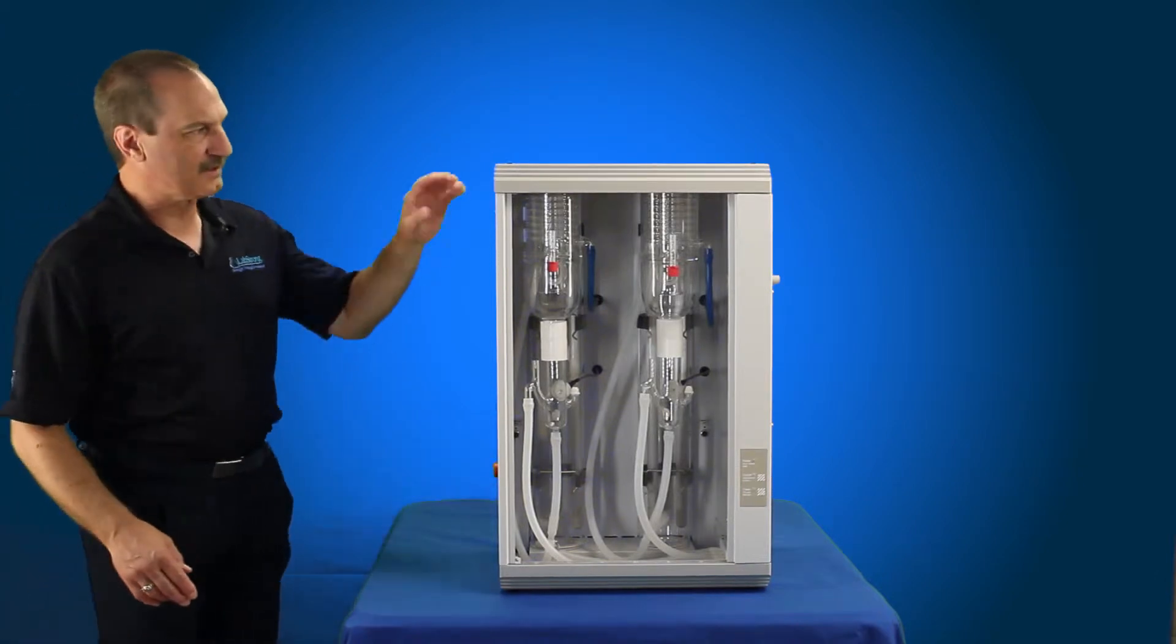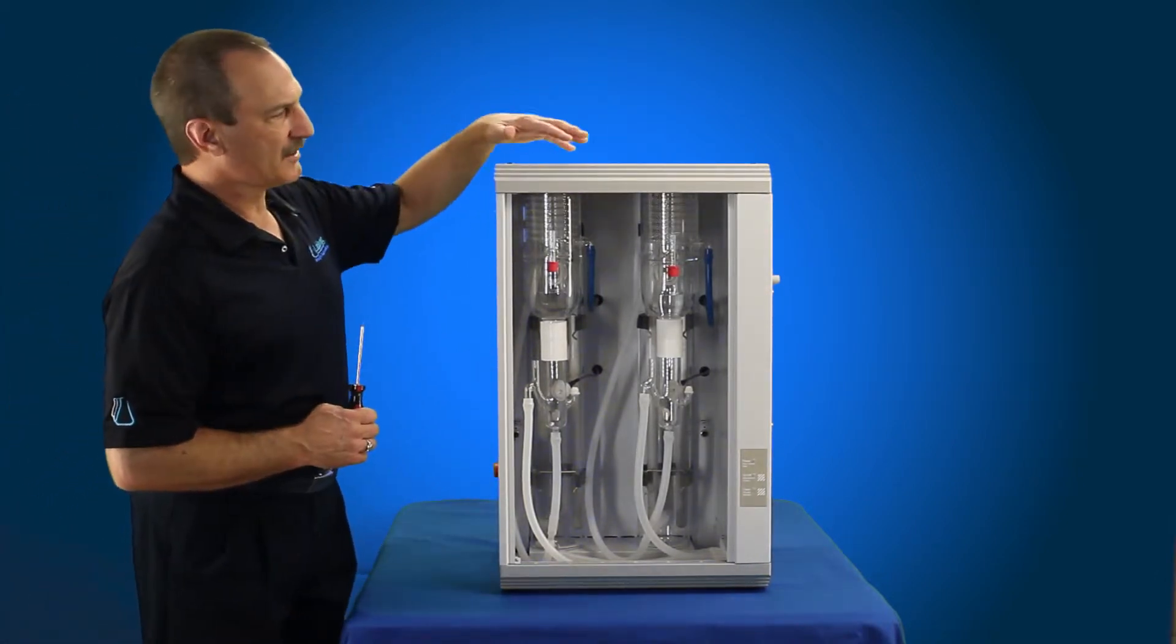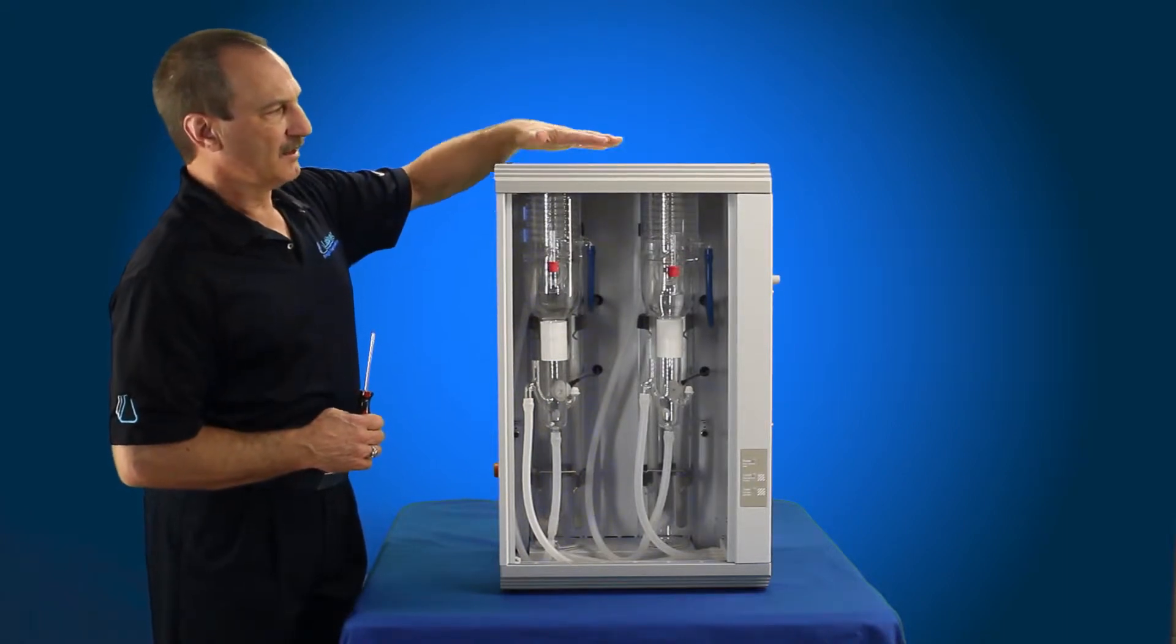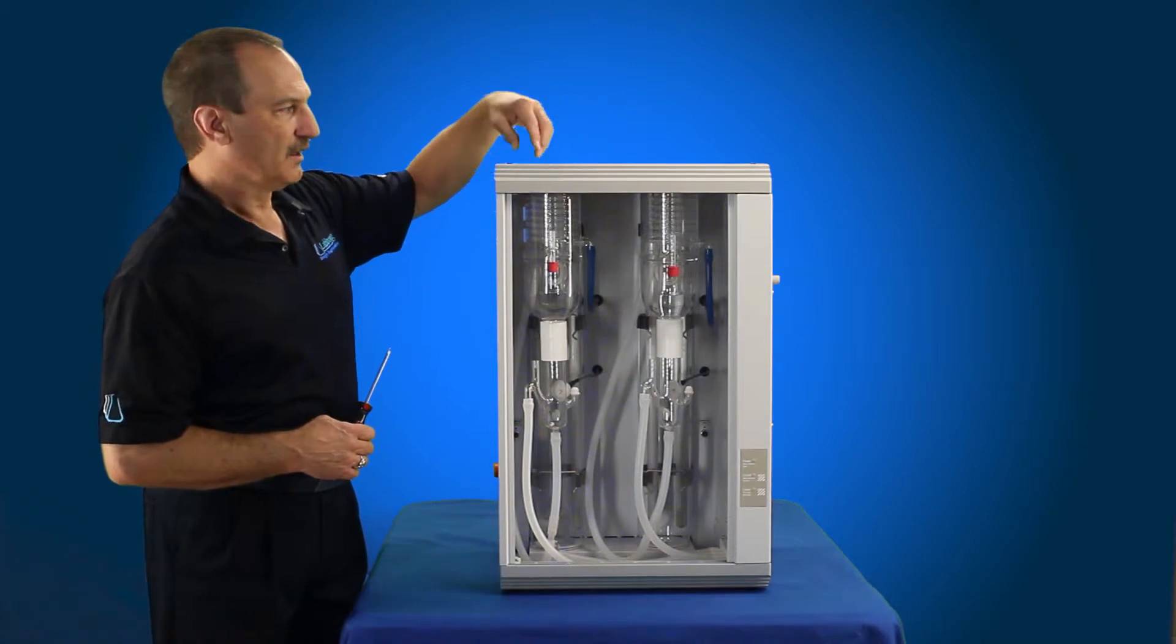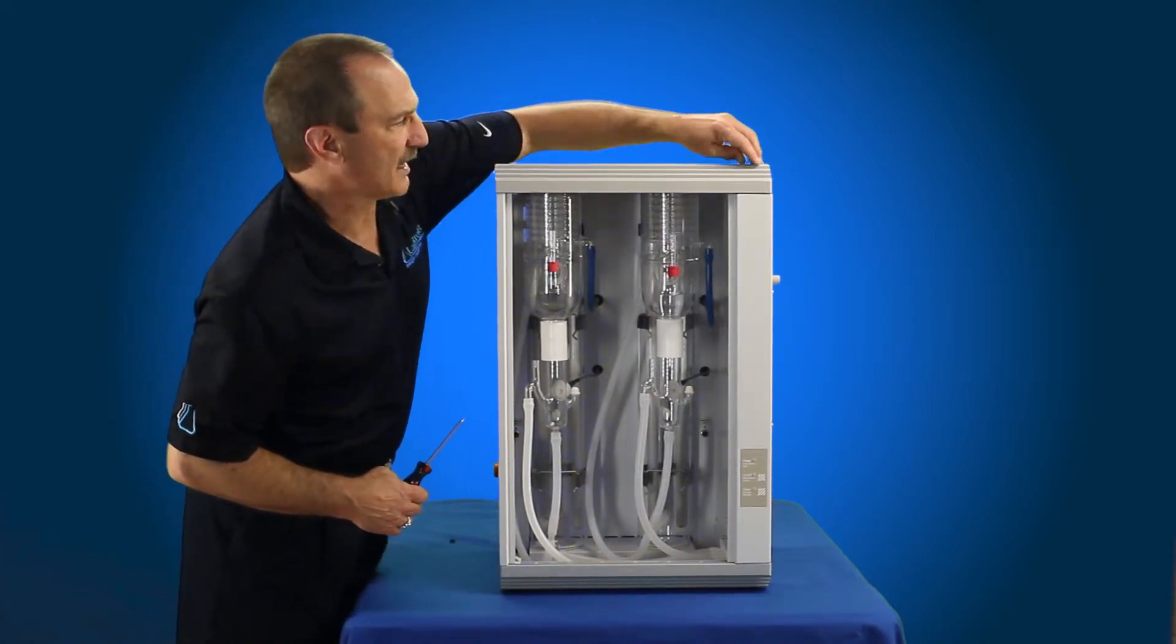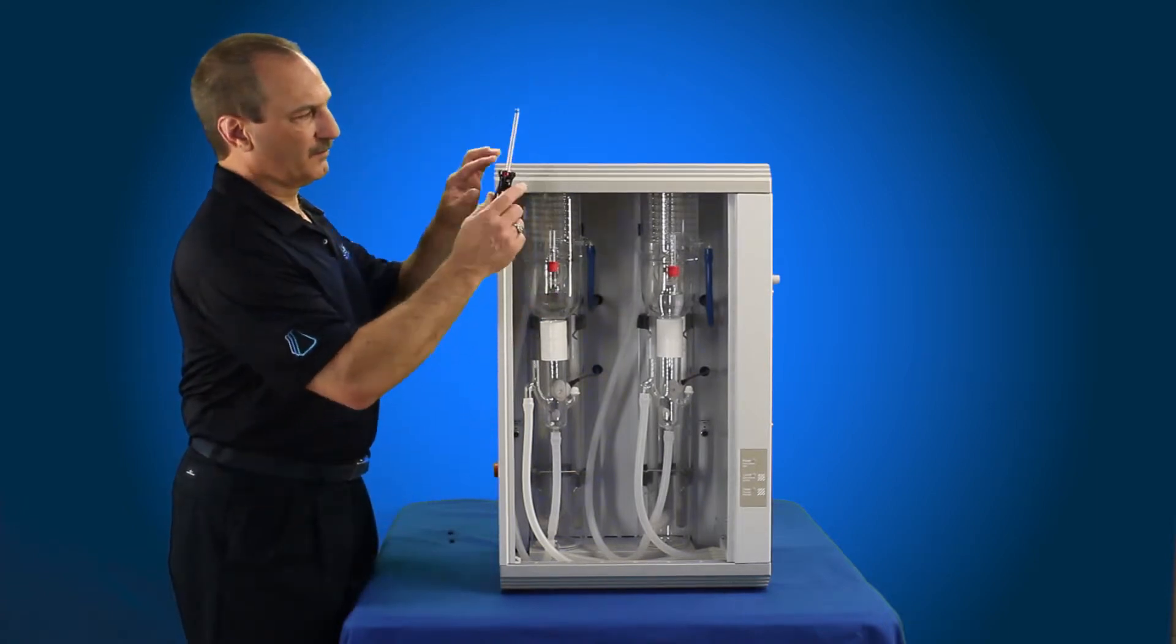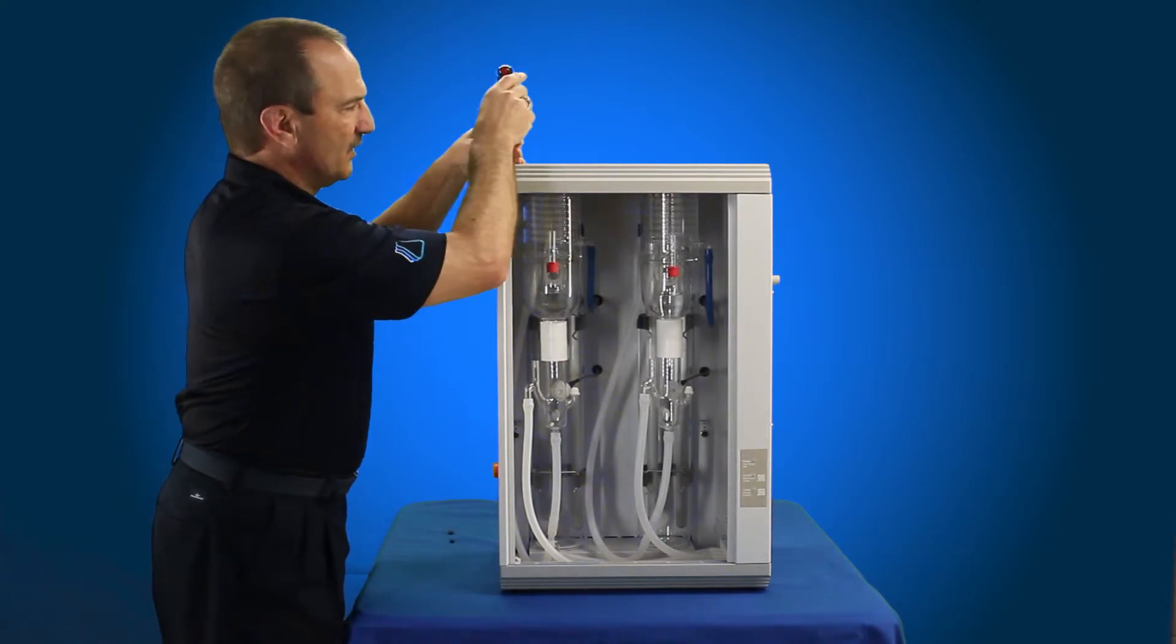Now we're going to go ahead and remove the top cover. Top cover for the eight-liter, the four-liter bi-distiller, same size. The top cover for the four-liter bi-Stream 3 is just a little smaller, but still has the same two blanking plugs that you're going to remove from the top. A Phillips-head screwdriver, two Phillips-head screws. I'm just going to go ahead and remove the screws from the front.